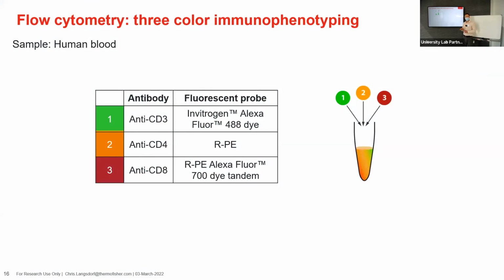In the case of more basic things, this is how we would do immunophenotyping, where we take antibodies against given markers. In immunology, they may be CD markers. In muscle or organs, these are probably not CD markers. They may be EpCAM or various cell surface markers, each labeled with a different color of dye. These may excite with the same laser, or with different lasers. On your Attune, this is probably going to be on your blue laser, and these are probably going to be excited with your yellow laser. So they each show up in a different channel. We add these to our cells.